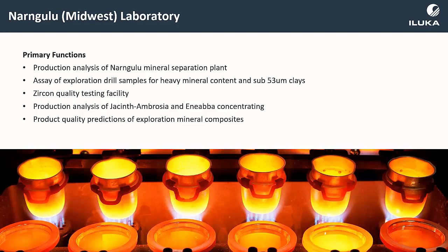So with our zircon that gets sold into the ceramics market, one of our important features of our zircon is its colour as an opacifier. So we actually do glaze testing.